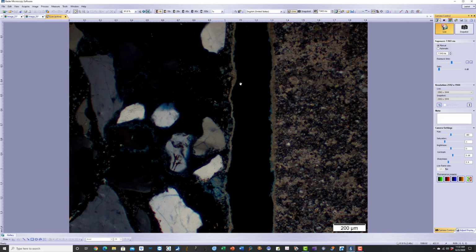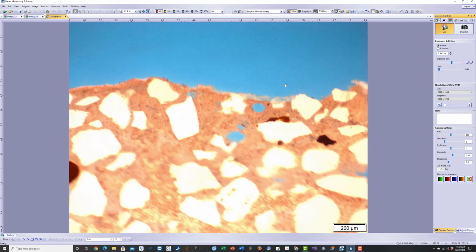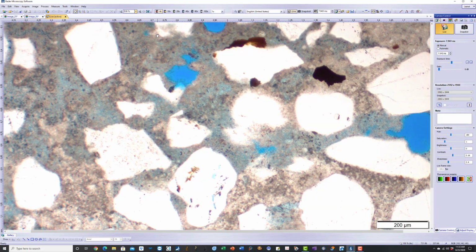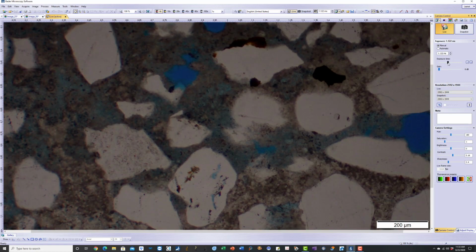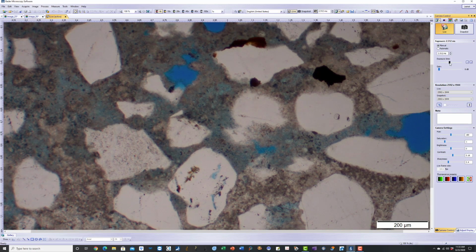So this is the first thin section I showed with the Basler microscopy camera, how this camera can be used at high magnification. Here is the crossbar you can place. And this is only 60% view. If you make it 100%, you get a much bigger area. And this is a 32-inch monitor, so you can really see the microstructure in greater detail when you use a larger monitor.